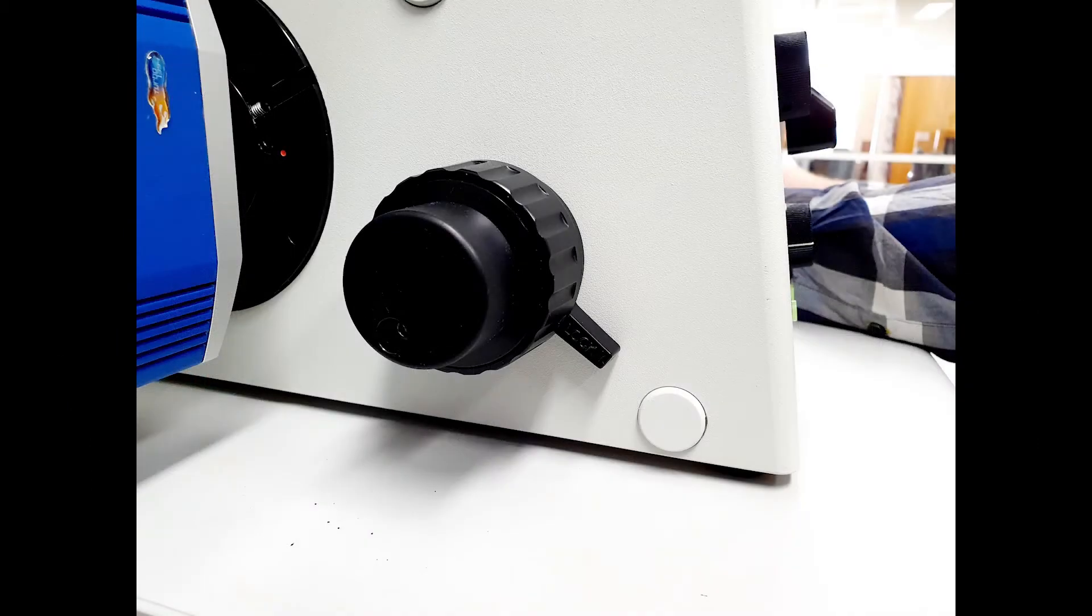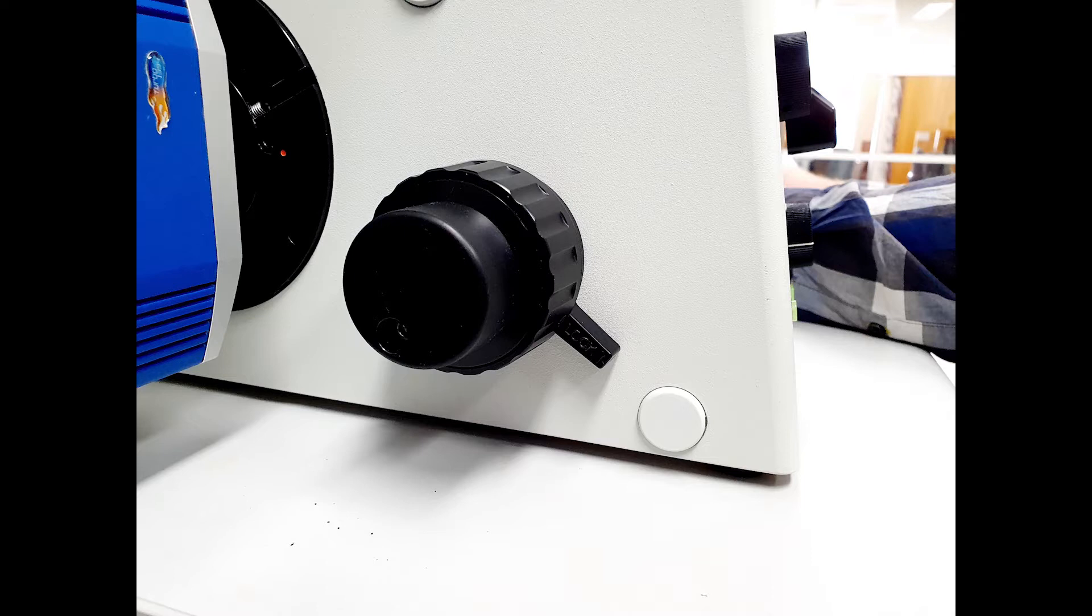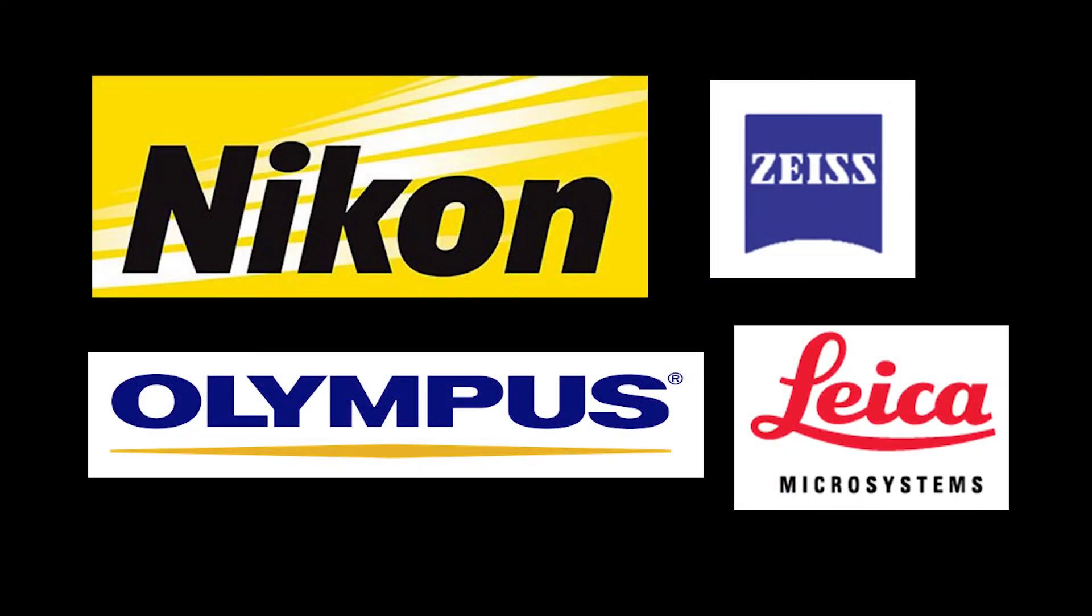All microscope stands have focus wheels that rotate to focus the magnifying objective through your sample. However, each manufacturer has chosen a different rotational direction, clockwise or anticlockwise, to move the objective towards your sample, so you'll need to learn and adapt to each system that you use.